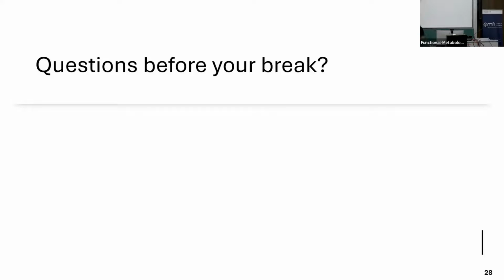So that's another thing. Yeah, we also had the same problem in the lab. Sometimes the incubators were just not behaving. Some person would come and change the RPMs in the middle of my run. You just have to be a bit careful, maybe use the same incubator all the time if that's possible.